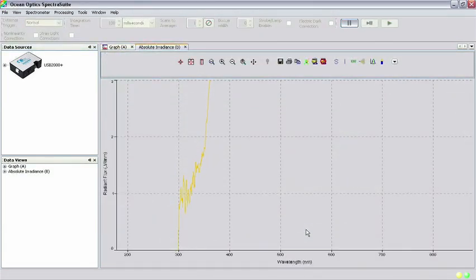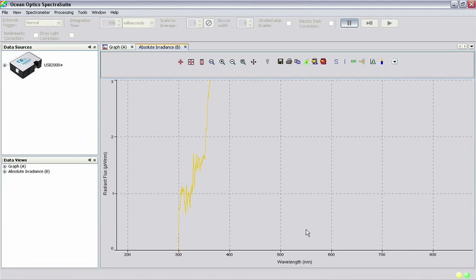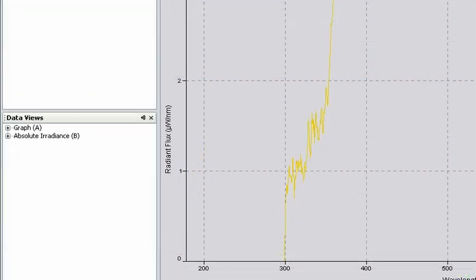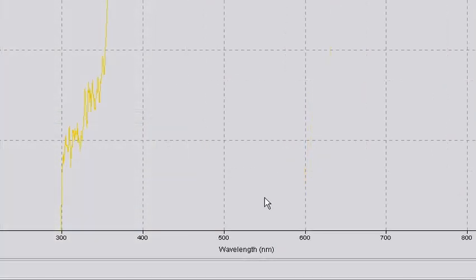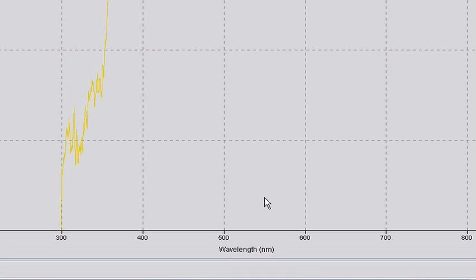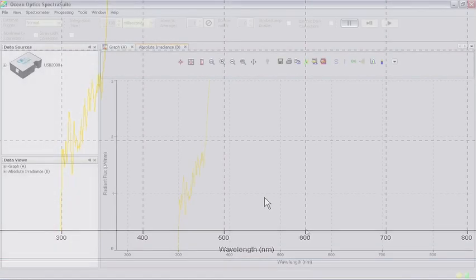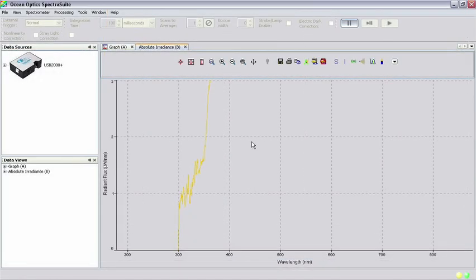In the main SpectraSuite window, you see a graph of the calibration light source with radiant flux in microwatts per nanometer on the Y axis and wavelength in nanometers on the X axis. You may have to click Scale Graph to fill window to see the entire spectrum.